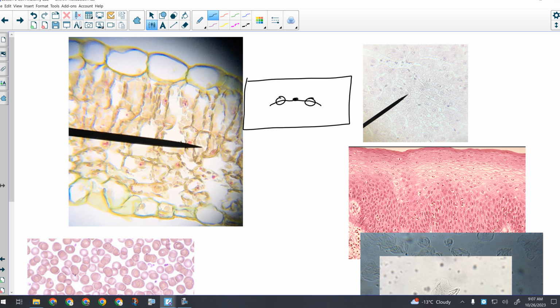So if you scrape your knuckle and peel off that skin, and then there's that skin that bleeds like crazy and stings like crazy right underneath, the red stuff, that's stratified squamous epithelia. That's what you're looking at in this slide. It's full of animal cells, and it looks like this, or this, depending on which stain you get.